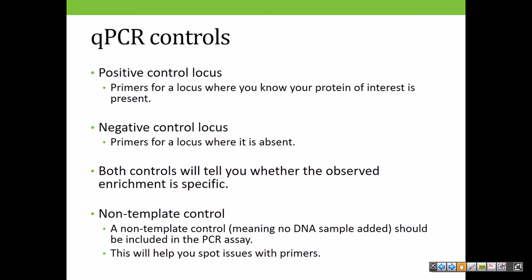Now that means a couple of things. Either A, you have a contamination, in the form of, sometimes your antibodies come contaminated, so maybe you isolated things that came with your antibody. It happens, they're called hitchhiker antigens. Or more likely, check your melting curves, chances are it could be a primer dimer. So your primers are binding to each other, forming a quantifiable product. The trick to find that, though, is the melting temperature is typically much lower than, say, a real DNA-created product. Typically, I think it's 80 degrees for DNA to come apart, but for the primer dimers, it's like 10, 20 degrees less.